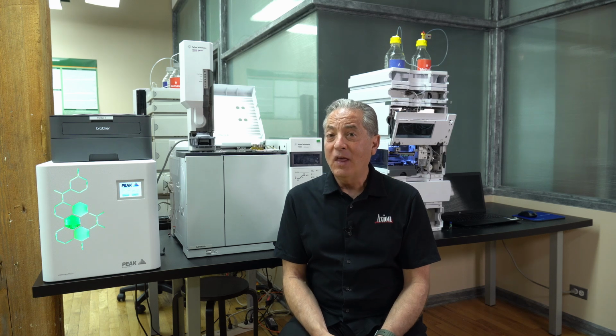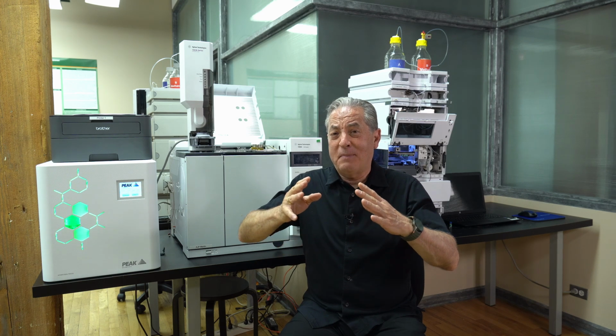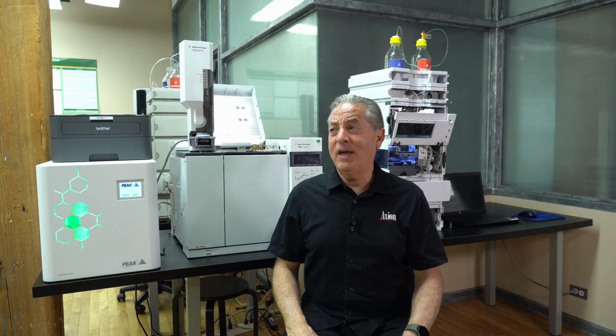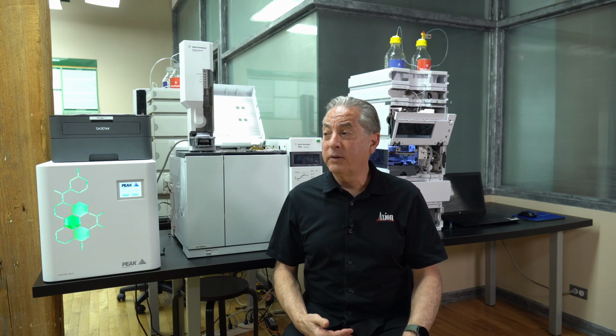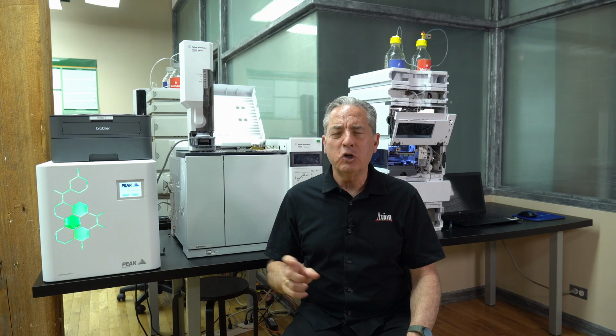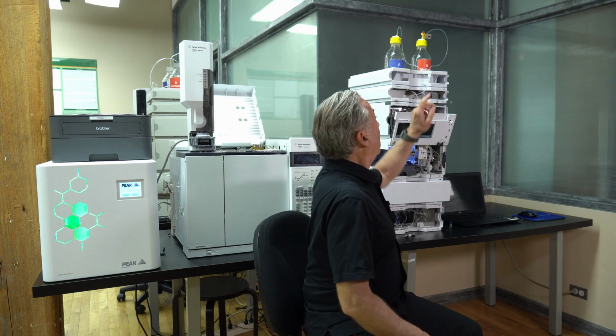Methanol, even though it's volatile, tends to reflux, so it will evaporate up to the top of the bottle, form little droplets, and come back down. So in my opinion, we get very little vapor coming out of the bottles. But if you want to deal with that, especially on your waste containers, there are some systems out there, little carbon filters that you put on the outlets. I happen to have a few of them up here.